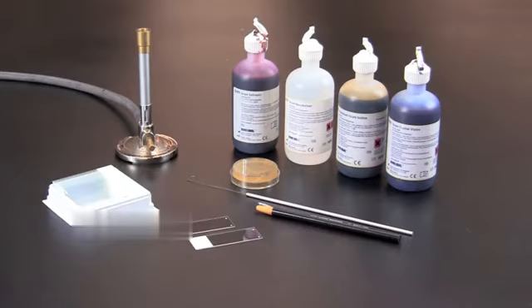In this video, you will learn how to perform gram staining. This technique utilizes a four-step staining procedure with two different dyes and is one of the first tests used when trying to identify unknown species of bacteria.